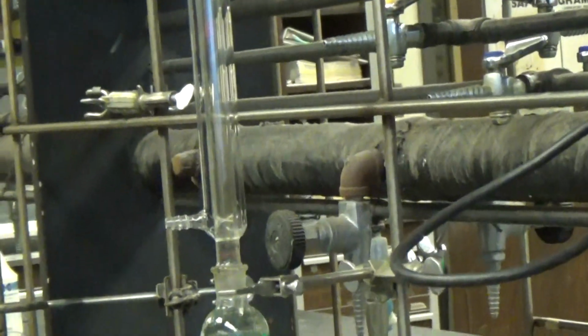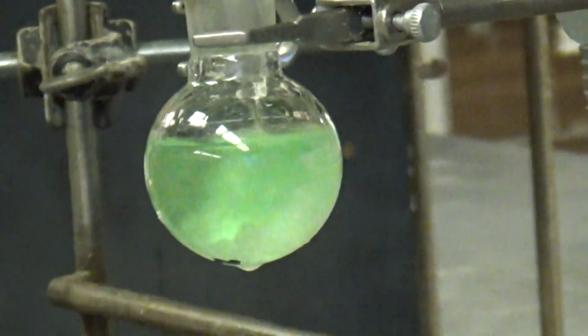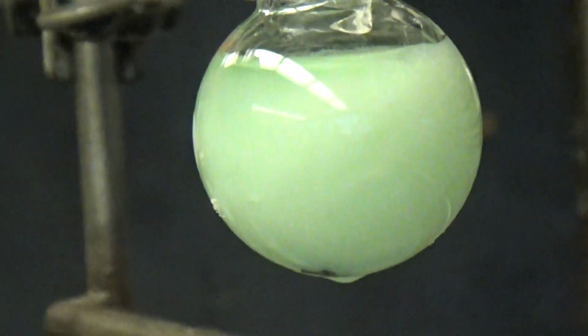And you add that from the top of the condenser, slowly, probably. Whoa, look at that. Precipitation. So that's your product, I guess. Yes, right? And you wait something like 2 minutes. Wait 2 minutes. That's cool.